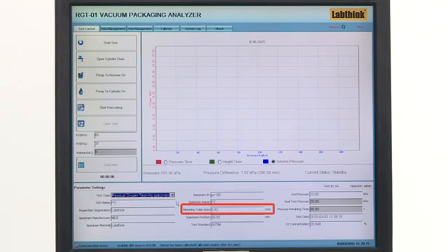The metering tube area shall be exactly the same with that of the metering tube used, or the test data may be severely affected. Sectional area of standard metering tube is 0.42 square centimeter. Specimen position. It is the distance between the specimen and the bottom surface of the PMMA cylinder. The distance is recommended to be 60 mm and not changed.